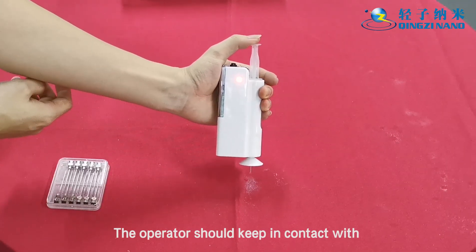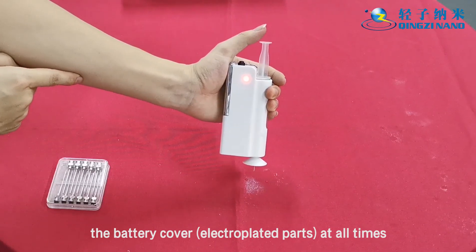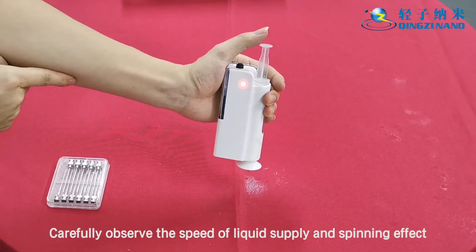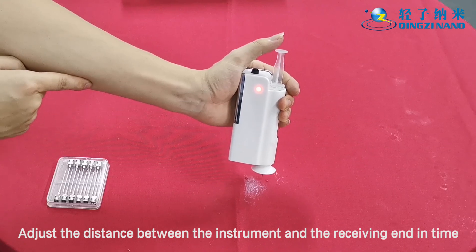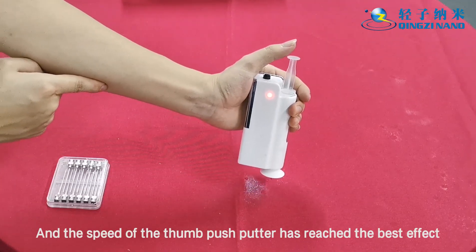The operator should keep in contact with the battery cover and electroplated parts at all times. Carefully observe the speed of liquid supply and the spinning effect, and adjust the distance between the instrument and the receiving end as needed, along with the speed of the thumb push, until the best effect is achieved.